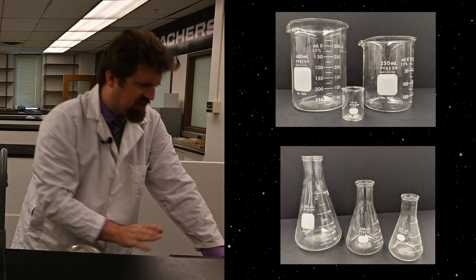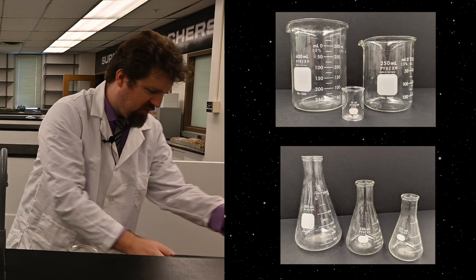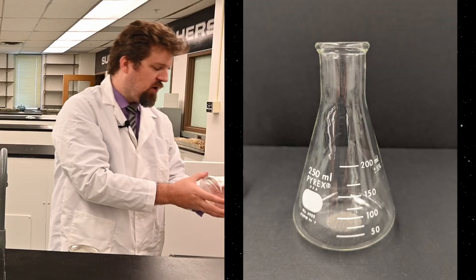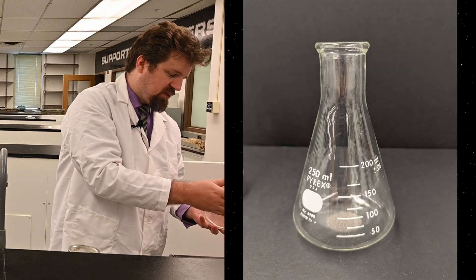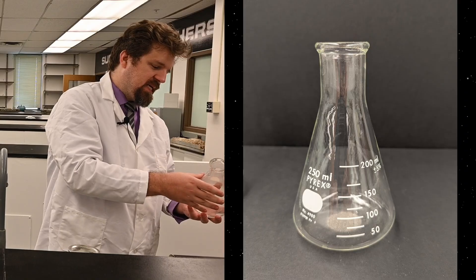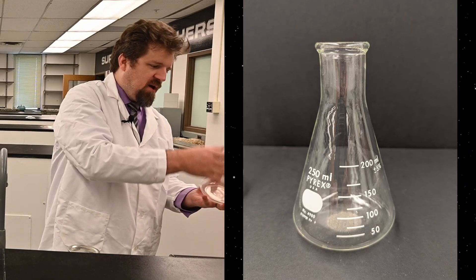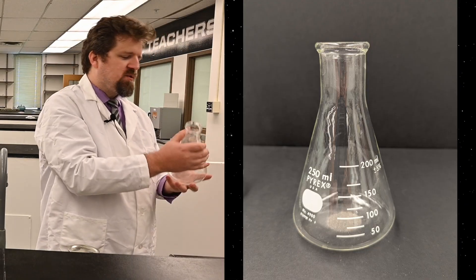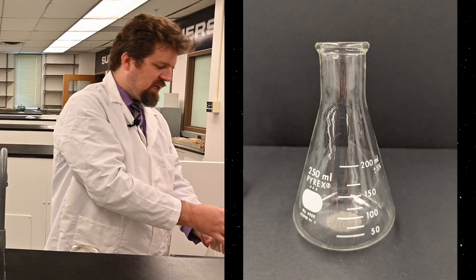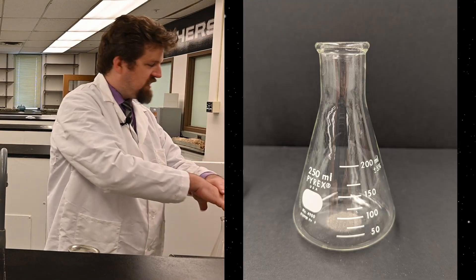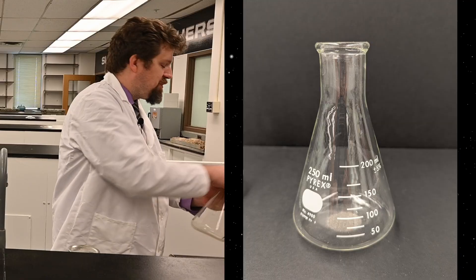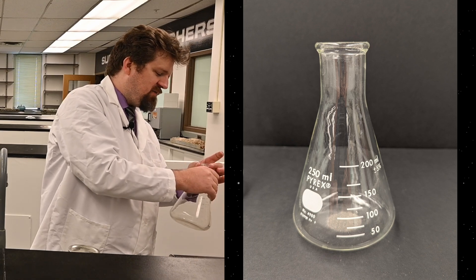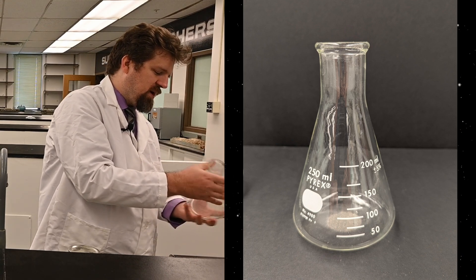The beaker and the flask, in my mind, kind of have similar roles. They just kind of hold stuff. Notice that the flask, this is specifically called an Erlenmeyer flask, probably the only one you're going to see, has a wide bottom and a skinny top and is used to hold liquids or solids. What's nice about this is because it has a skinny top, you're less likely to have things drop into it. You can also put a stopper in the top and make it a little bit more secure.